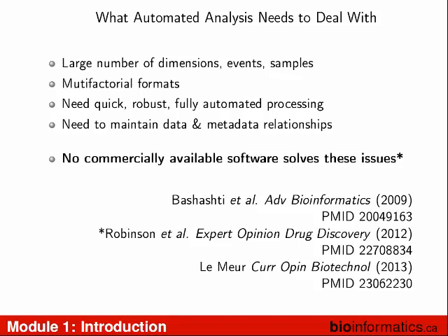And so the more stuff you can do in Excel is fantastic. We work with Excel all the time. It can be a great tool to annotate data. So you have your FCS files, you read them in, and then you also have this Excel spreadsheet that has all that extra information. You spend a lot of time getting all those columns and rows organized, right? And then you read that in and you put the two together. That's a fantastic way to work. But getting people to annotate in a structured way has been the biggest difficulty.